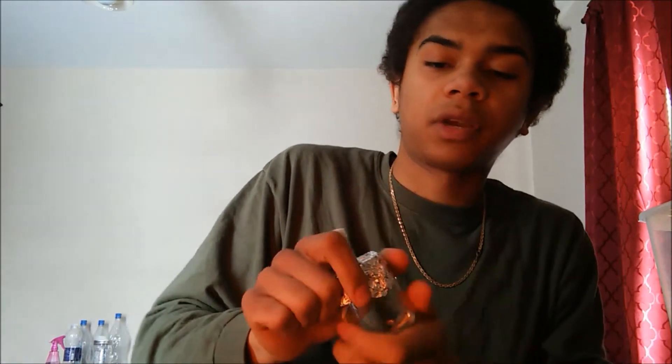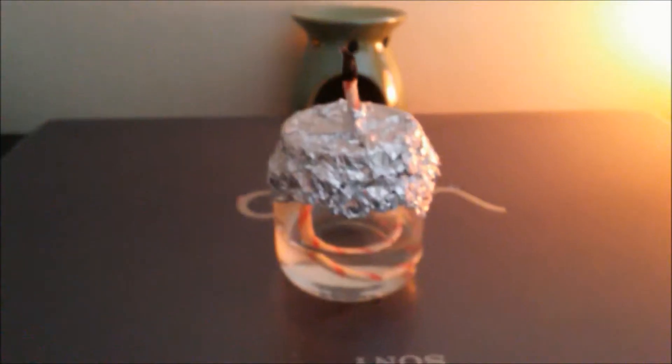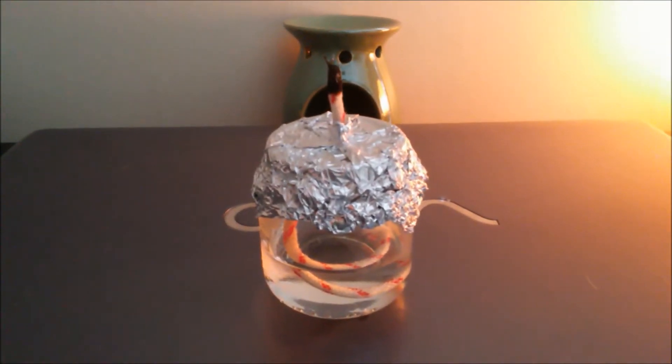Now we're going to add some 70% isopropyl alcohol and let our wick soak until it's ready to be lit. We're going to fill it about a little less than halfway. Make sure your lid is tightly and snugly screwed on. There you have it — your very own alcohol lamp.